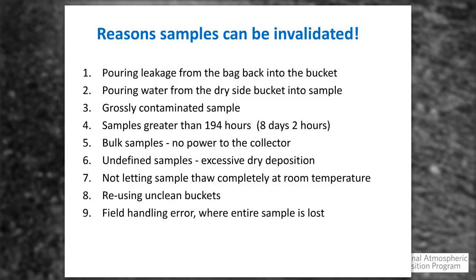Number one, generally a good rule is once water has left the bucket, short of pouring it in the bottle, it's gone. If you transported the bucket from the field and it leaked out, it spilled into a tray, it's gone. Don't attempt to recover any of that, because we know the chemistry is compromised.